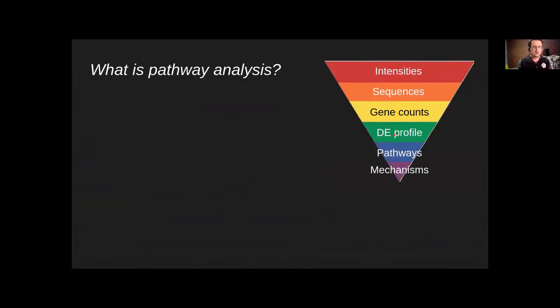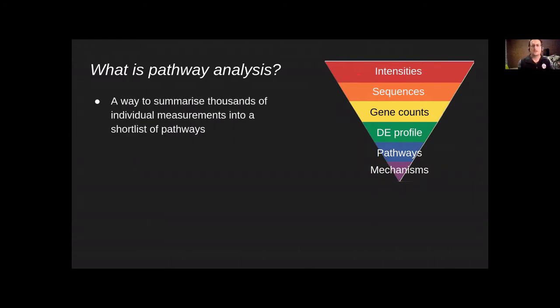It's basically about pathway analysis. Now, I'll just give you a bit of background as to what I mean by this. If you've been involved in omics analysis previously, we tend to have this flow of large raw data getting summarized down to more and more distilled, meaningful information. So we have sequences that get summarized down to gene counts and further on to differential expression or differential enrichment.